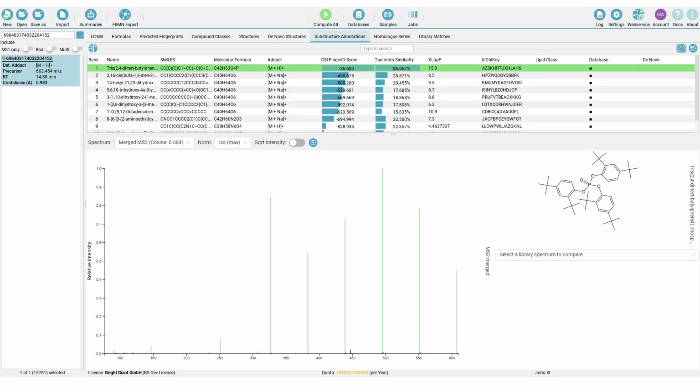by the peak. It is very important to note here that this substructure matching is not related to how SIRIUS scores structure candidates. It's merely a visualization tool based on combinatorial fragmentation of the candidate structure. Since combinatorial fragmentation can't take rearrangements into account, they will also not appear here as fragment annotations. This does not mean that SIRIUS cannot annotate structures that form rearrangements during fragmentation.